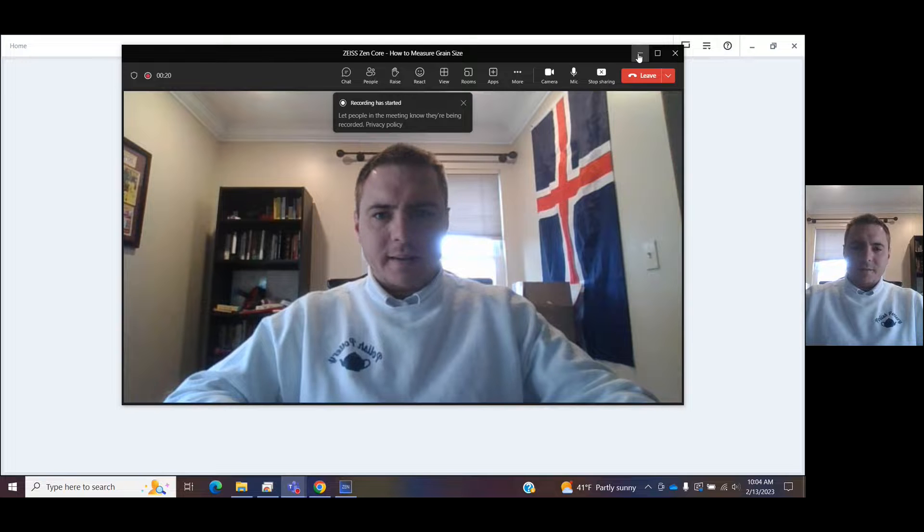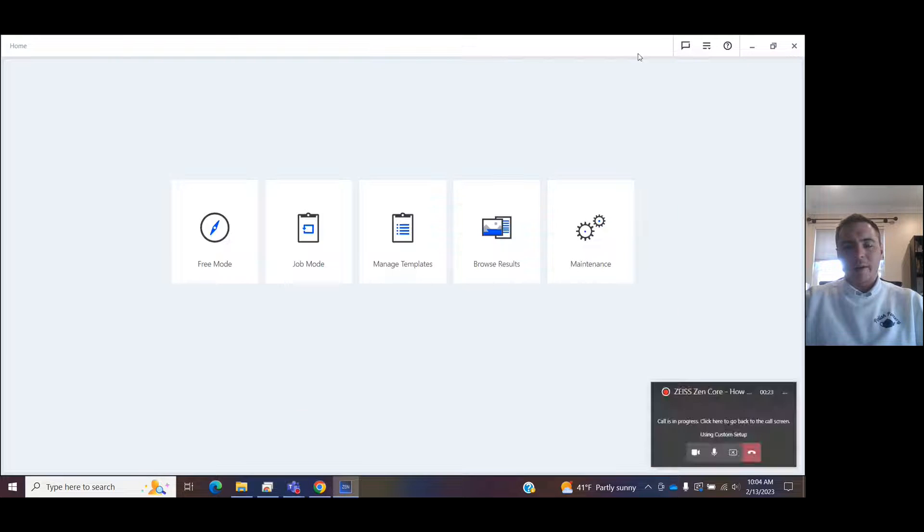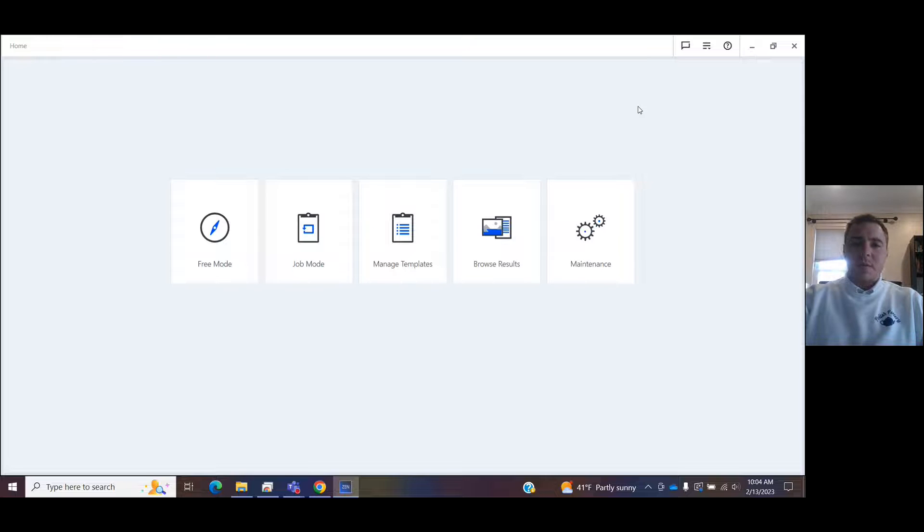Clayton Bishop here with High Tech Instruments, Zeiss Business Partner, and I wanted to go over today how to measure the grain size in your samples using Zeiss Zencore.